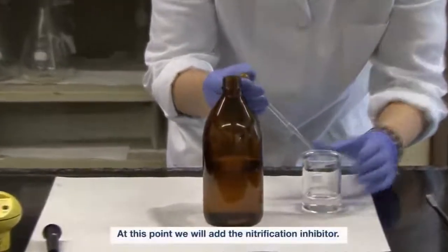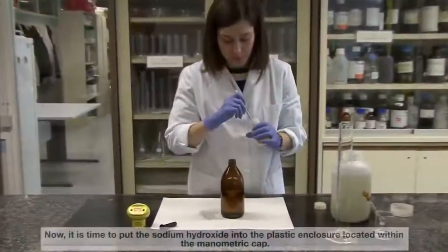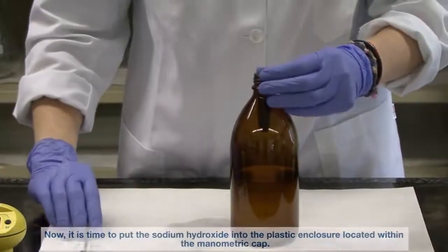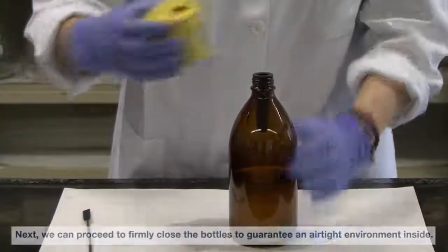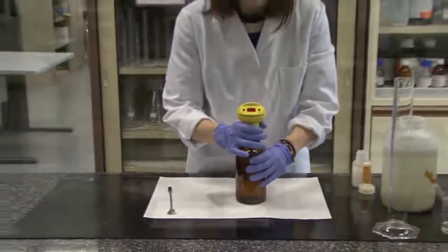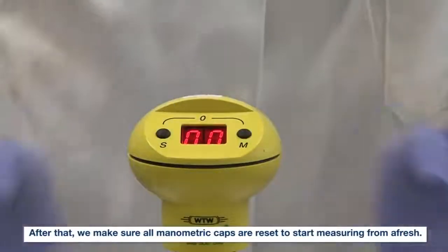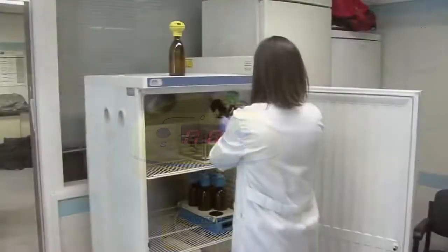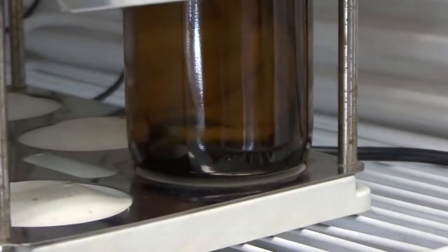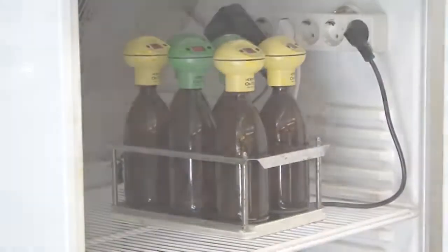At this point, we will add the nitrification inhibitor. Now, it is time to put the sodium hydroxide into the plastic enclosure located within the manometric cap. Next, we can proceed to firmly close the bottles to guarantee an airtight environment inside. After that, we make sure all manometric caps are reset to start measuring from afresh. Once that's done, we introduce all recipients containing our samples in the magnetized tray, which is already located inside the incubator at 20 degrees Celsius in dark conditions.